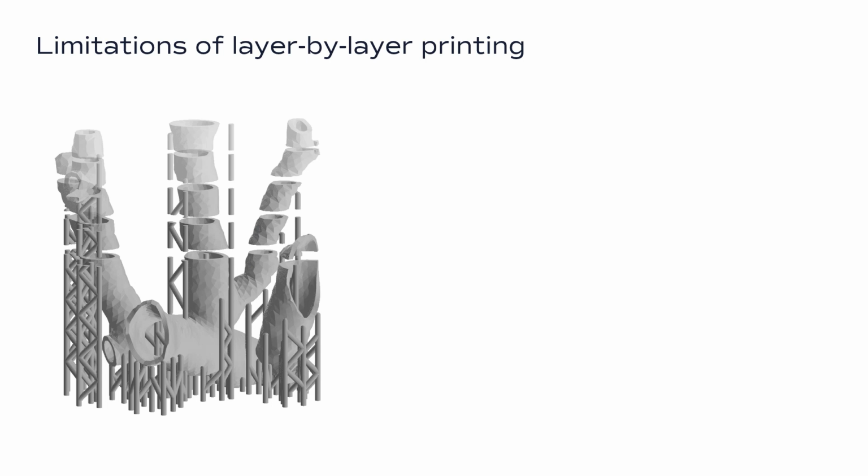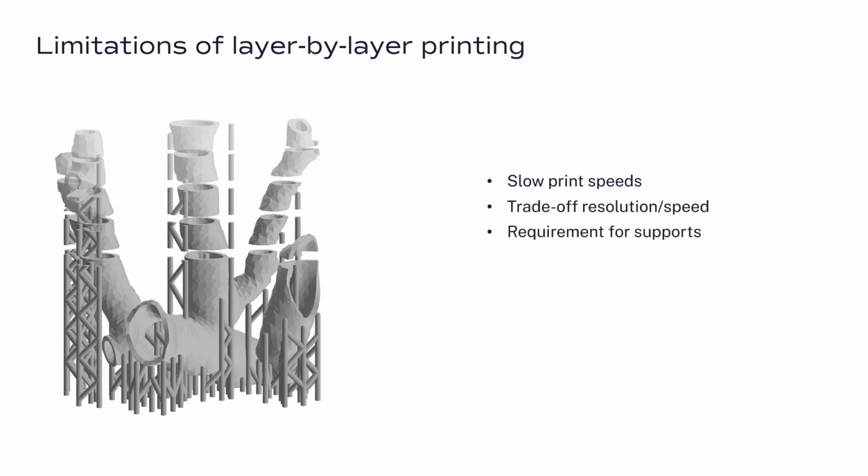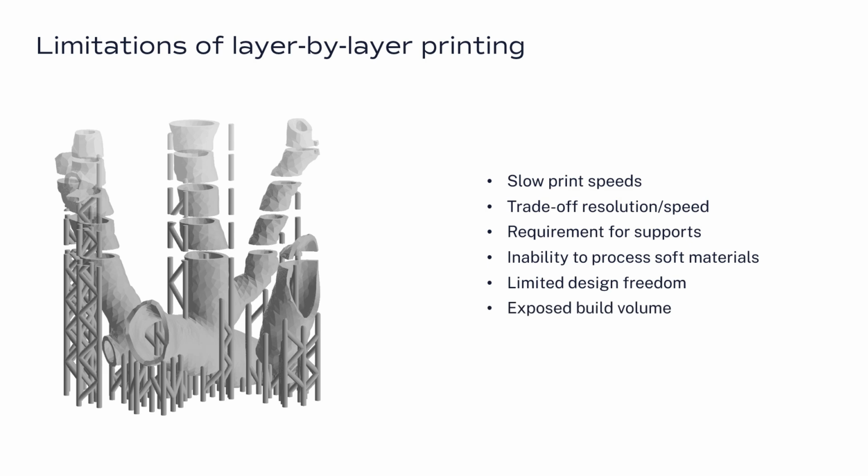Most 3D printers nowadays operate on a layer-by-layer fabrication process, such as extrusion or stereolithography. Common limitations of such approach include low throughput and its trade-off with resolution, the need for support to prevent deformation during the print, especially with soft materials that would collapse under their own weight, difficulties with cavities and vasculatures, the challenge to maintain contaminant-free environments, and the harsh conditions faced by cells in those devices.